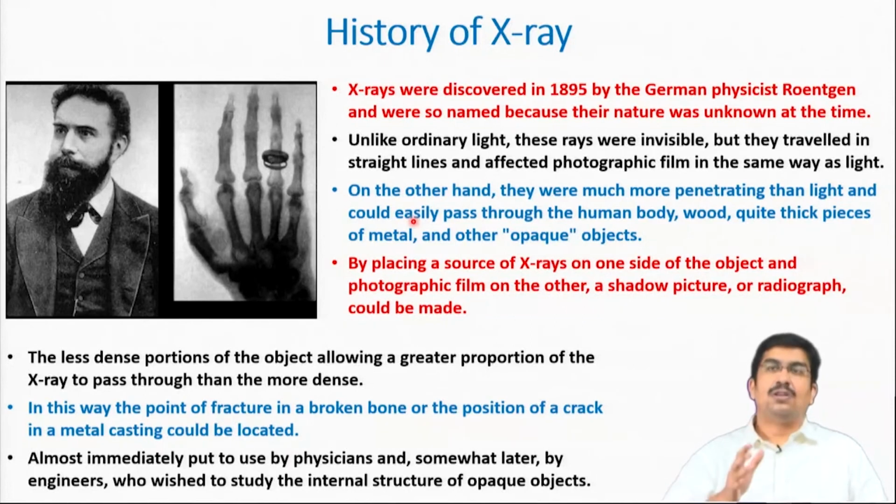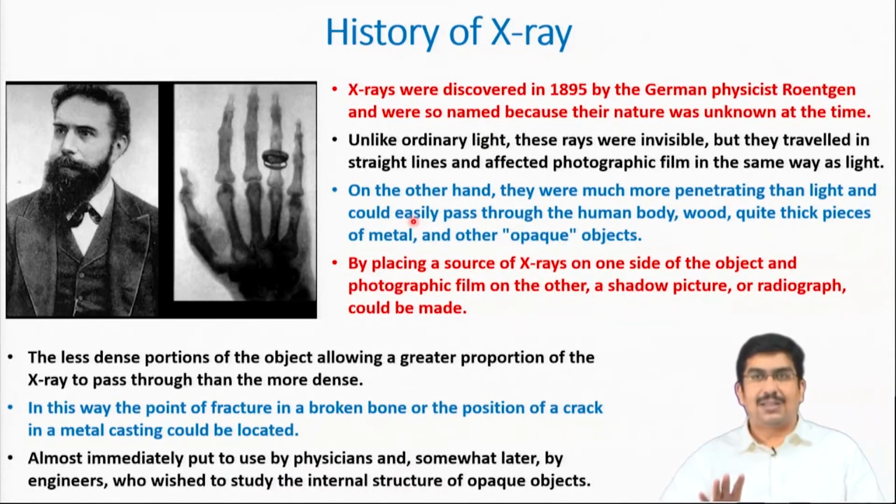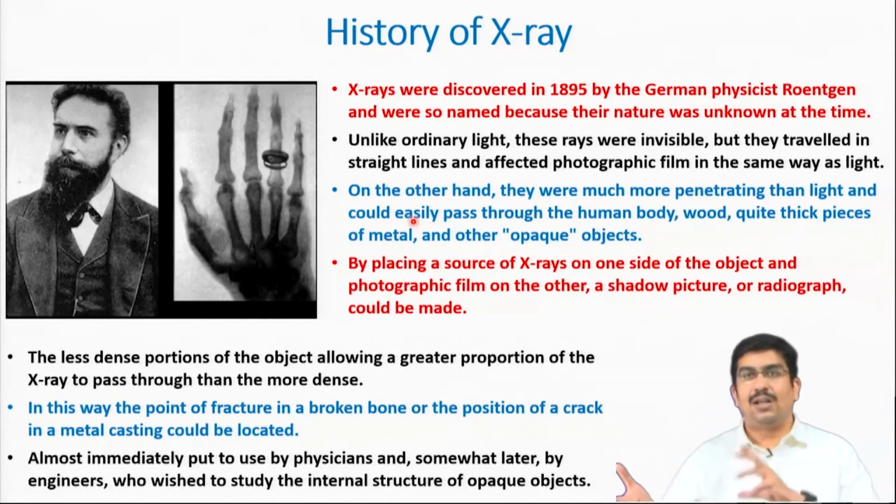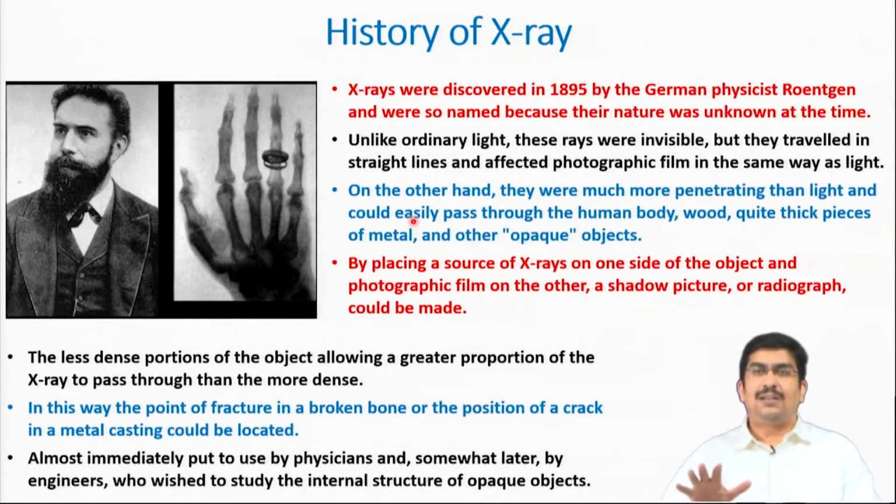They can also be used for diffraction experiments, for imaging purposes, and for chemical analysis and so on and so forth. The point is, till today there is not one single instrument available to do all of this. Although certain companies are claiming that they are able to combine imaging and diffraction and so on, it is not very reliable. Till now, different types of X-ray machines are used for different purposes. The X-ray diffraction machines are different, and the X-ray imaging ones are different.